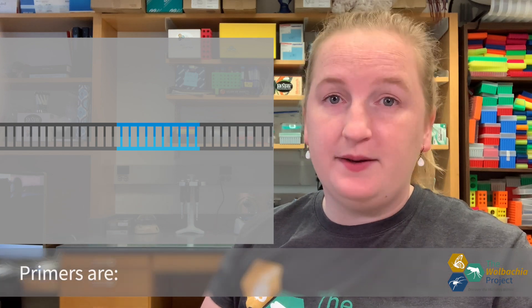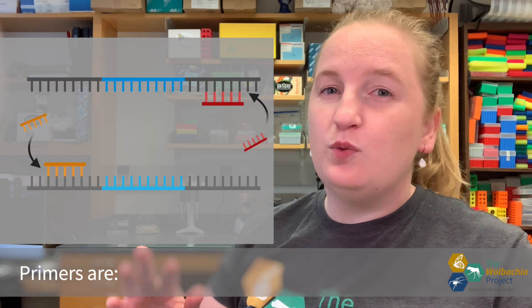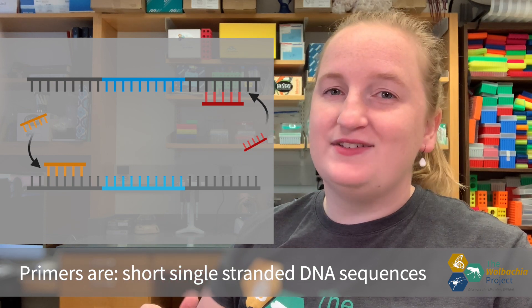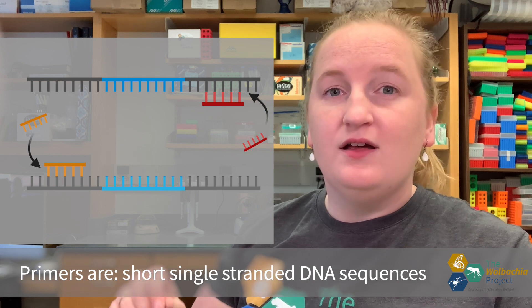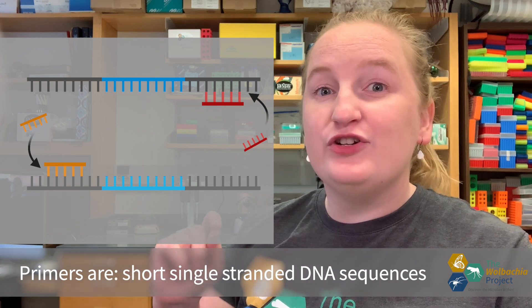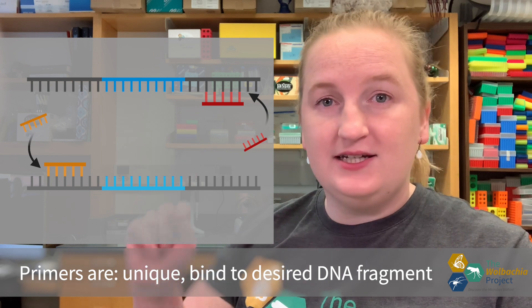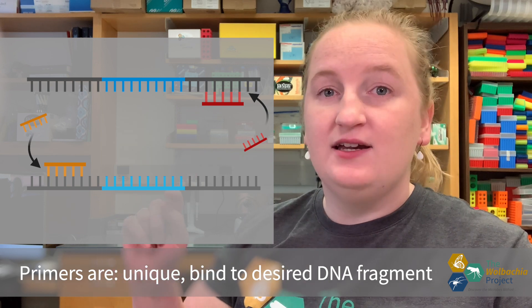So how do we amplify just this region? We use primers. Primers are about 20 base pairs long, and they're fragments of DNA that I like to think of as the control find of PCR. They're long enough that they're unique and will only bind in one location. As bind to Ts, Cs bind to Gs, and vice versa.